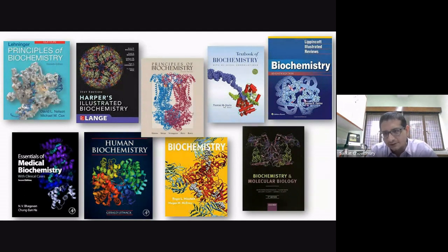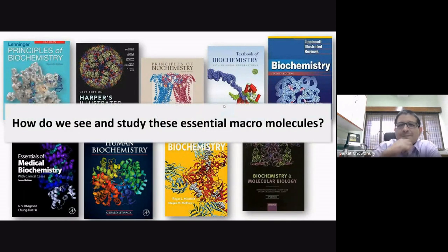But structure ultimately tells you the three-dimensional shape of the molecule, and why that shape, or the juxtaposition of the different amino acids and building blocks, imparts its function, right? So it becomes important and interesting, rather than just the pretty aesthetic pictures that we see in biochemistry textbooks. So I'm going to talk about how we see these macromolecules.